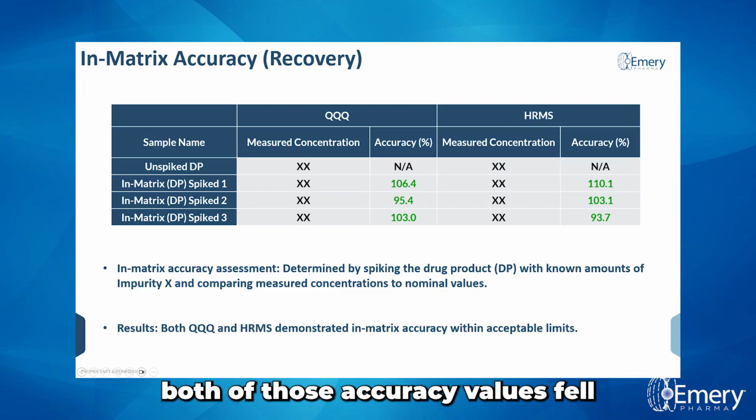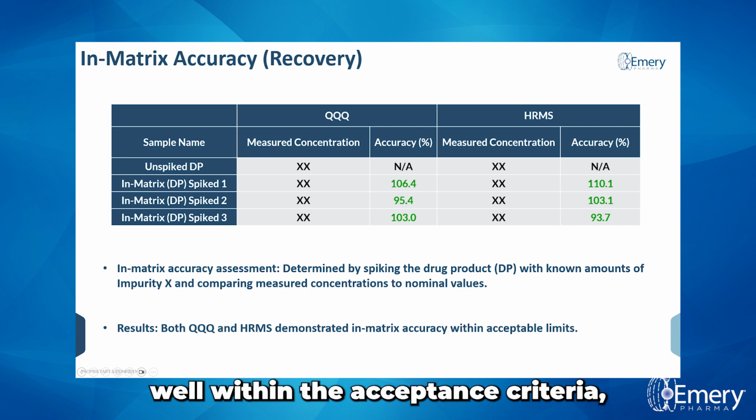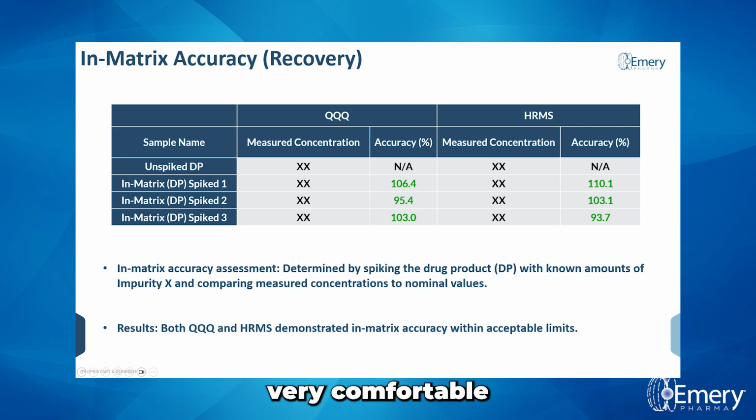Interestingly, both of those accuracy values fell well within the acceptance criteria, making us feel very comfortable that our methods can quantitate this impurity or these analytes accurately within whatever drug product we are testing.